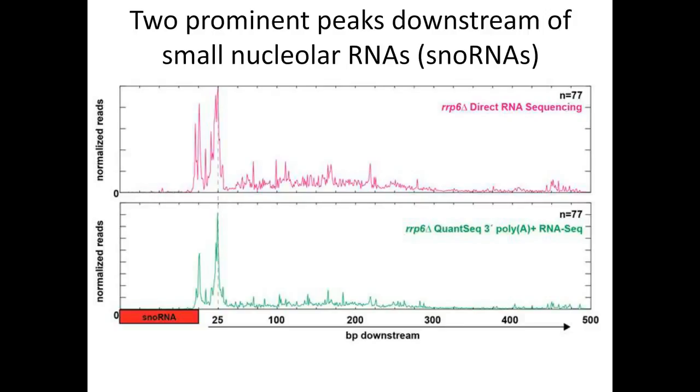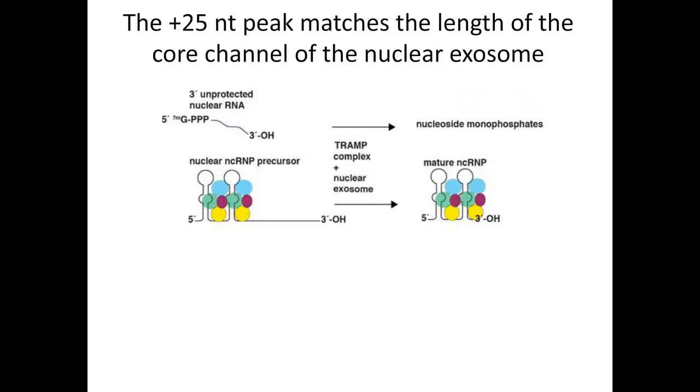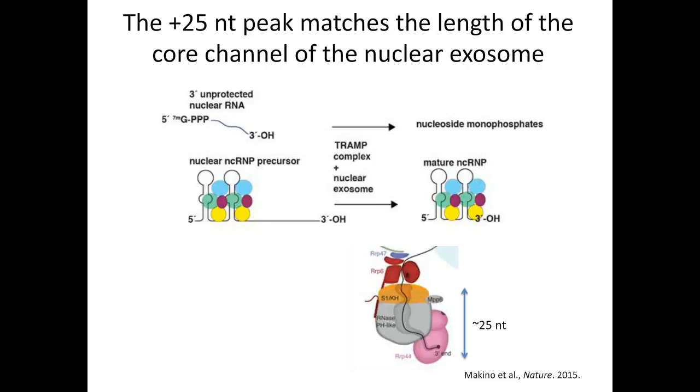And that broad range of signal we initially suspected was the actual termination product from the NNS pathway, the Nrd1-Nab3 termination pathway. And the 25 nucleotide peak we noticed matched the length that is accommodated by the nuclear exosome channel. And so we suspected that perhaps what we're seeing here is a processing intermediate, so that we haven't fully inactivated the nuclear exosome.